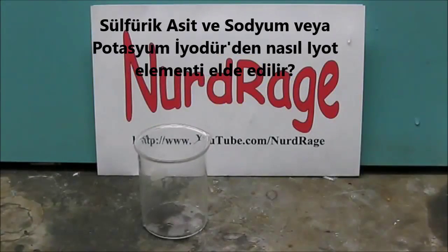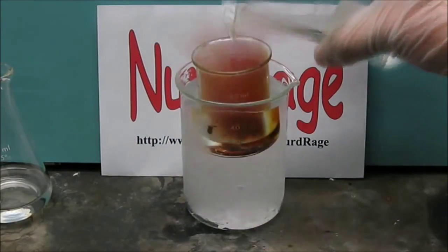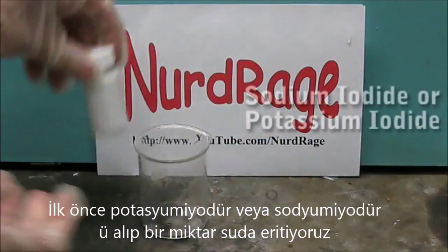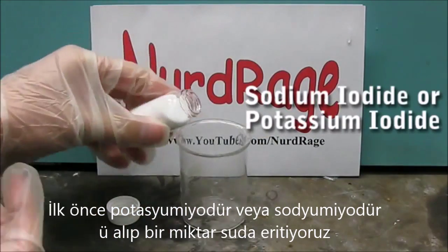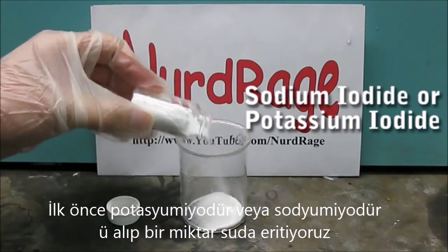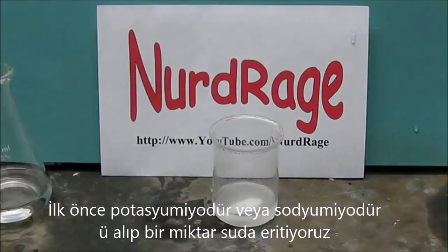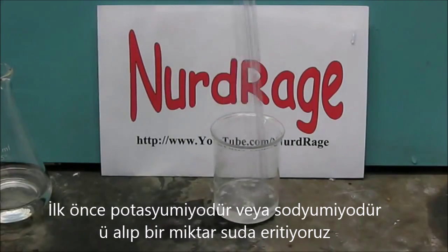Greetings, fellow nerds. In this video we'll be showing one way to make iodine from an alkali metal iodide and concentrated sulfuric acid. First, we get some sodium iodide. You can also use potassium iodide for this experiment. Either one of these chemicals is easily purchased online. With stirring, add just enough water to completely dissolve the sodium iodide.